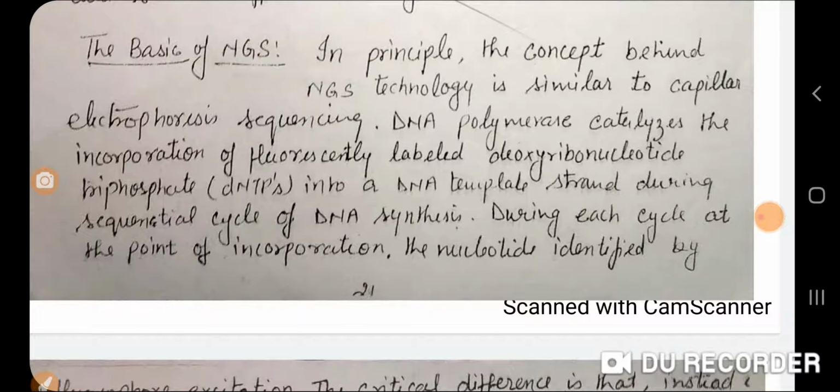So what is the basis of next generation sequencing? In principle, the concept behind next generation technology is similar to capillary electrophoresis sequencing. DNA polymerase catalyzes the incorporation of fluorescently labeled deoxyribonucleotide triphosphates, dNTPs, that is dATP, dTTP, dCTP and dGTP, into a DNA template strand during sequential cycles of DNA synthesis.